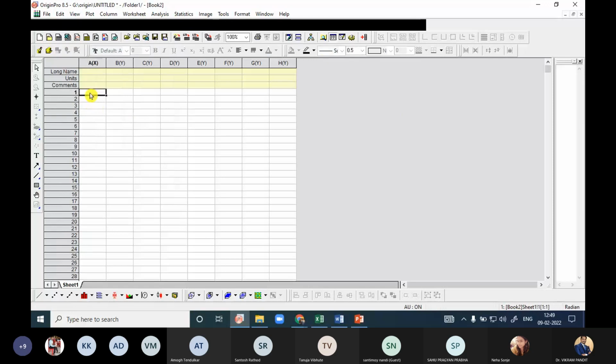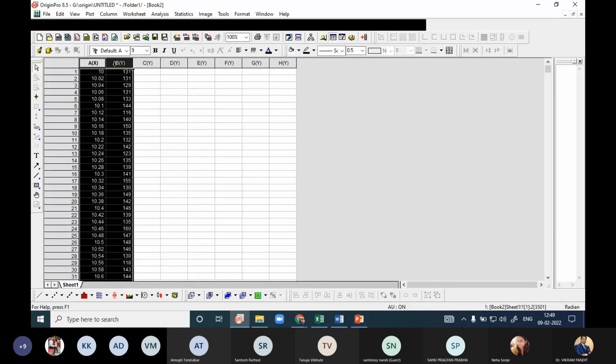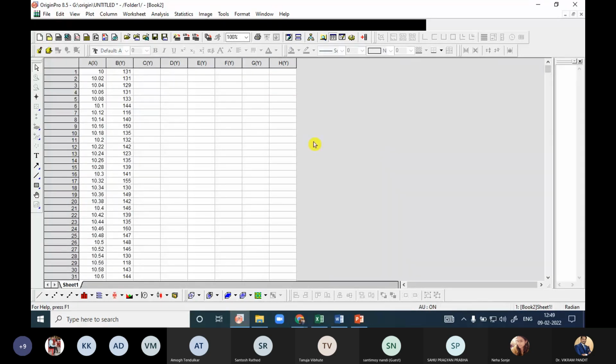So a better way is to just go here and select these two columns. For getting a good quality spectrum, just delete this. Okay, you have deleted this, selected this, and Control-paste. This is for one. Now again go into the Excel.